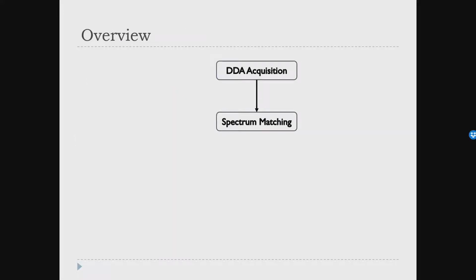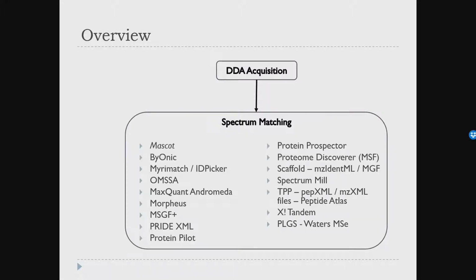And then you're familiar with spectrum matching, which you can do in any of these ways, and Skyline supports all of them. So how many of you do spectrum matching with some tool you don't see up here, or some pipeline you don't see up here? If you do, go ahead and contact us, and we're always happy to add more. We've been at it for almost a decade, and Skyline's library building has become sort of a hub for other tools that are using the libraries that we produce, and it's because pretty much any peptide spectrum matching that the field does, we support.